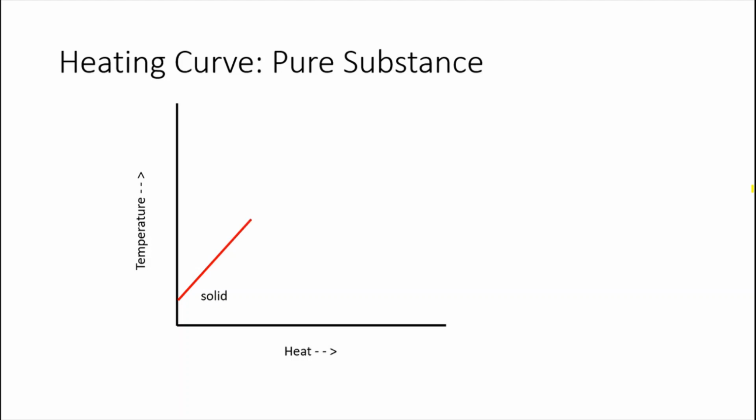the temperature starts increasing and increasing, and then at some point, curiously, it starts leveling off quite a bit and reaches sort of a plateau. It's not completely flat, but it definitely doesn't change that much. And then after a while, we notice that it picks up again and the temperature starts increasing once more. At that stage, though, the substance is already a liquid. That means that during that quote-unquote plateau of temperature, melting was happening.